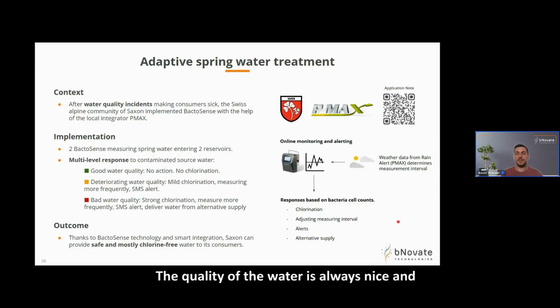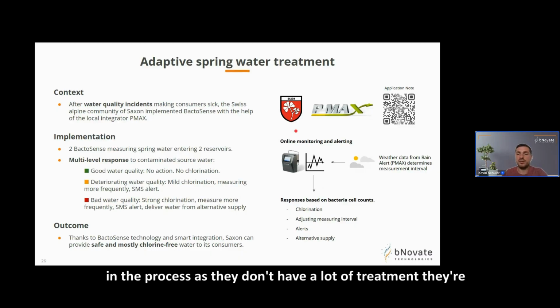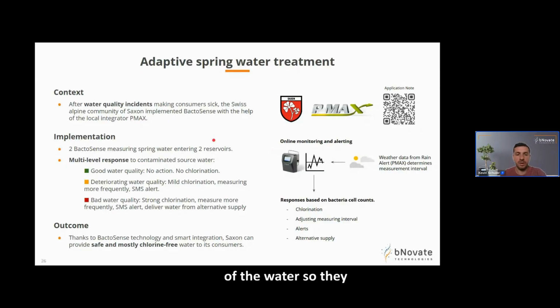The quality of the water is always nice and doesn't need a lot of treatment, so chlorination is mostly done to prevent any risk when it's raining or when there's some external environmental risk. It's coming back from a few incidents in the process, and as they don't have a lot of treatment, they're most sensitive to hygiene risk in their water.